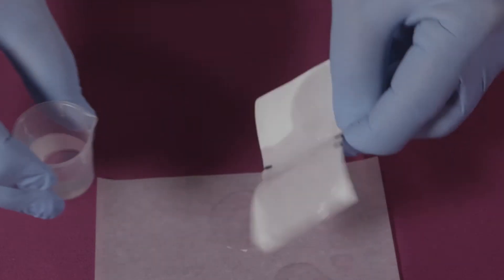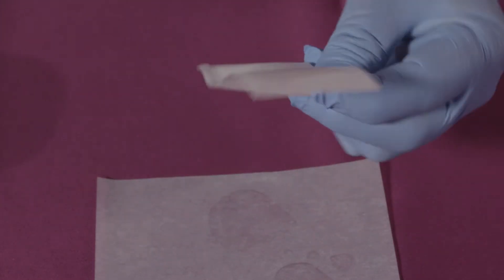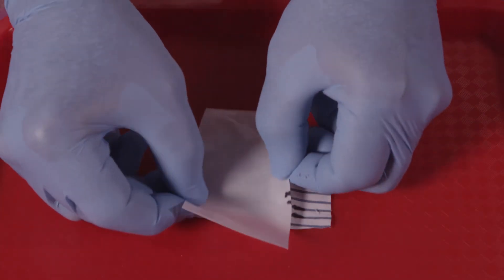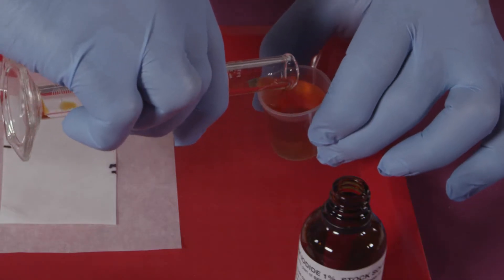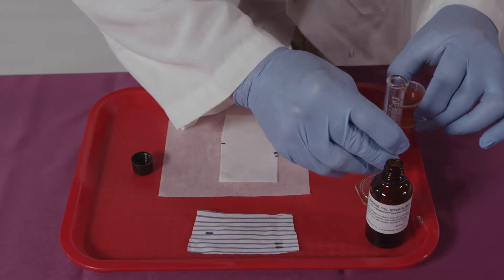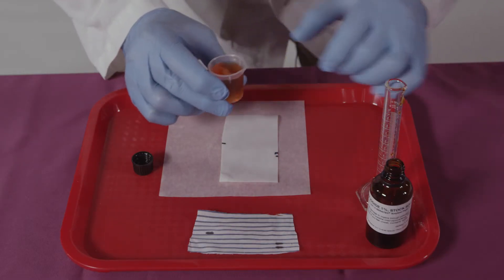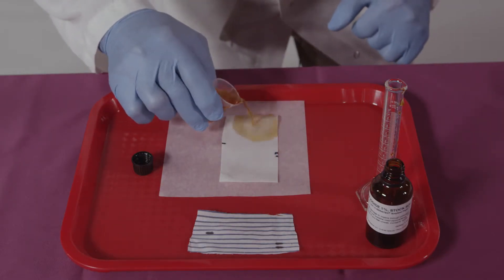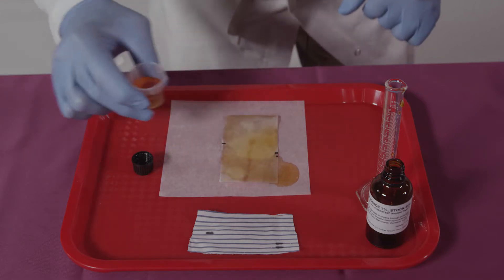Ceratec amylase paper contains starch and when moistened and overlaid upon a dried saliva stain, amylase in the stain digests the starch in the paper. After a short incubation at room temperature, a solution of iodine is applied and developing white areas on the paper indicate the presence of the enzyme amylase or saliva.